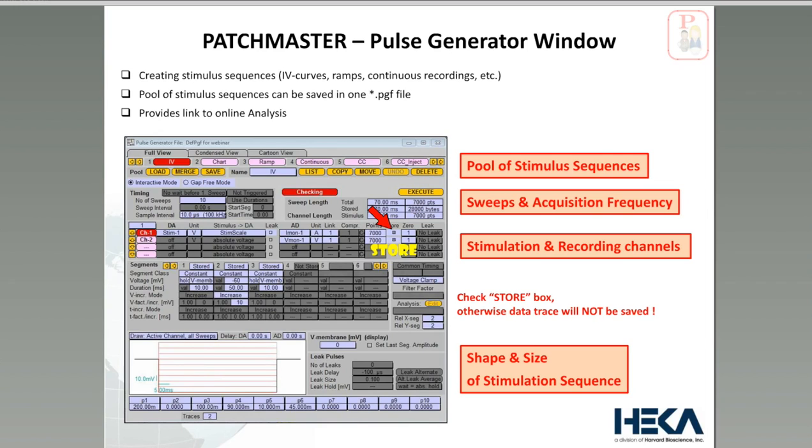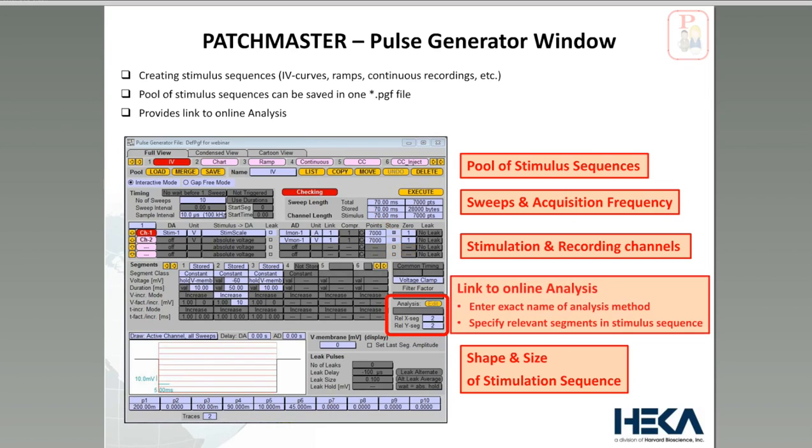So there is a fail-safe device built into the control window, which I will show you later, that when you do your recordings you can see with one look at the control window if the data trace is being recorded or not. I will also show you later in the live demonstration a feature that also should alert you immediately if your data trace has not been recorded. Okay, so this will come in a minute.